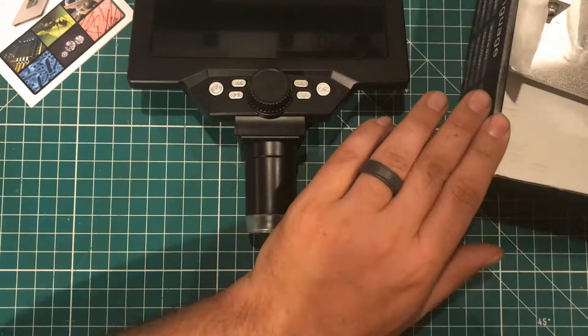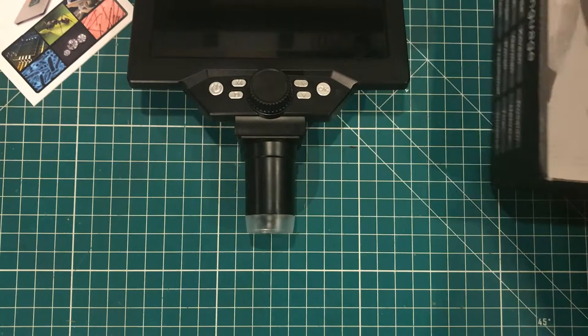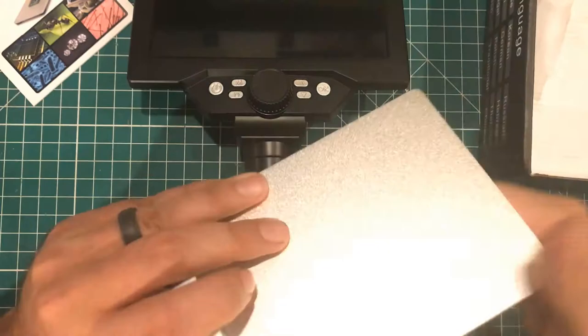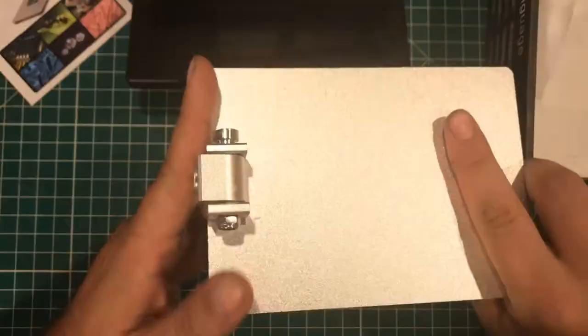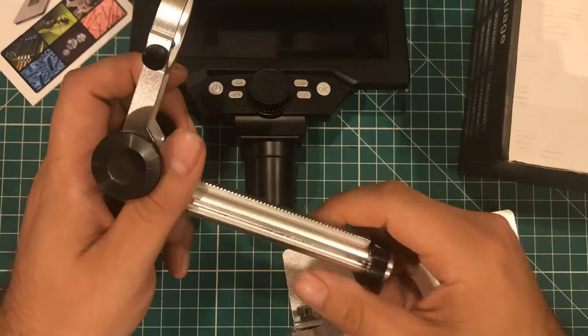We have the power brick. They did send me the adapter for the U.S. power brick in a separate package. Nice aluminum, chunky, some kind of centered metal base here and a little adjustable thingy. We get the arm — again, nice piece of metal. Everything feels like it's well machined and of decent quality.